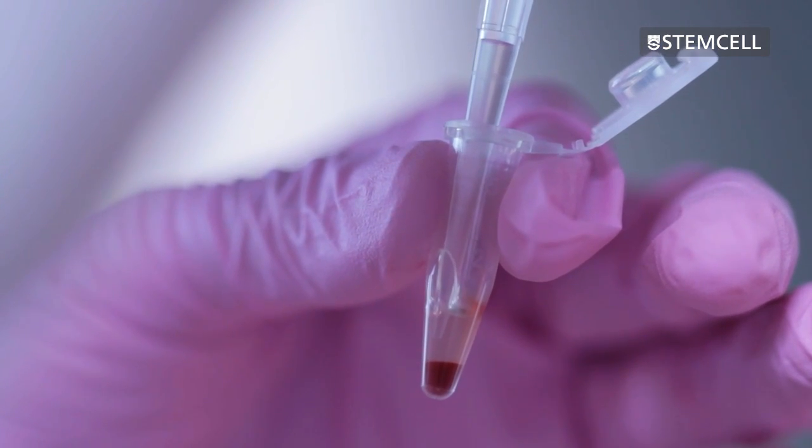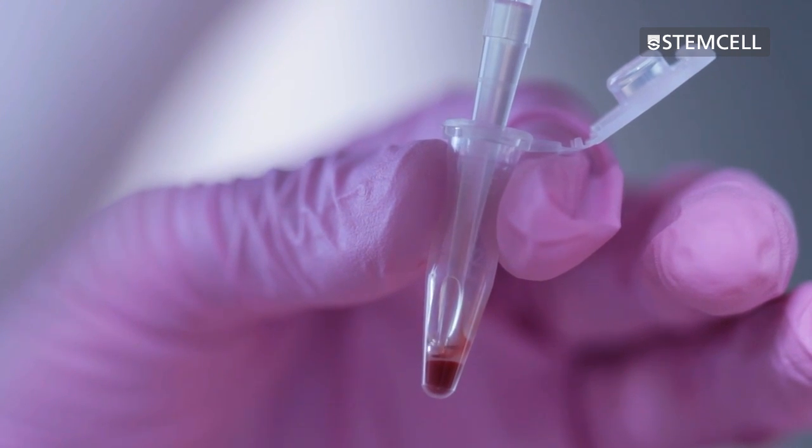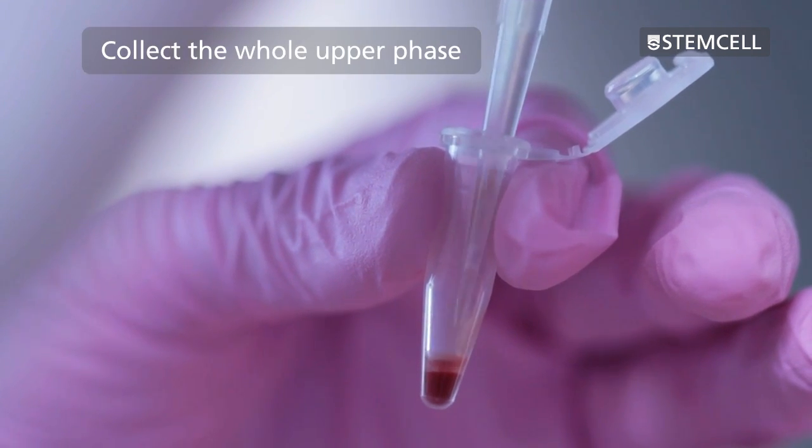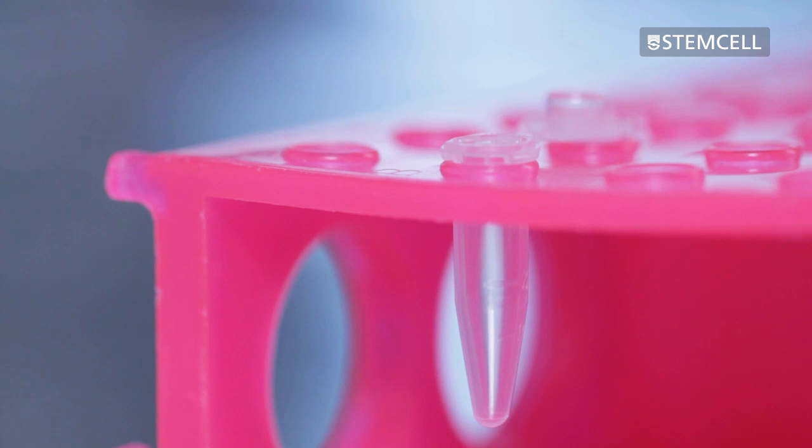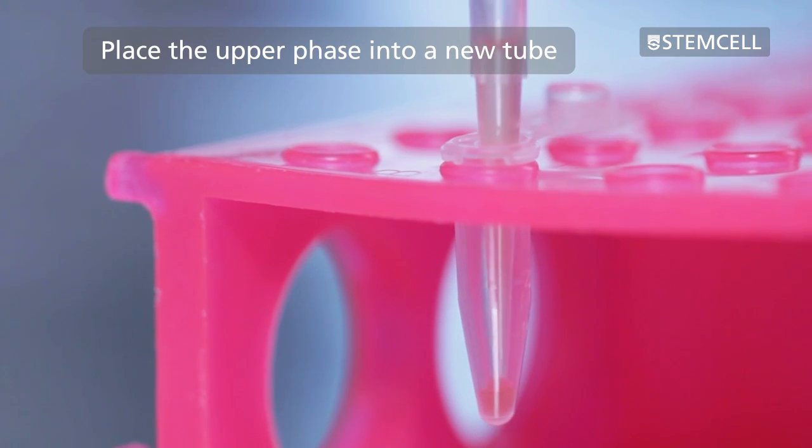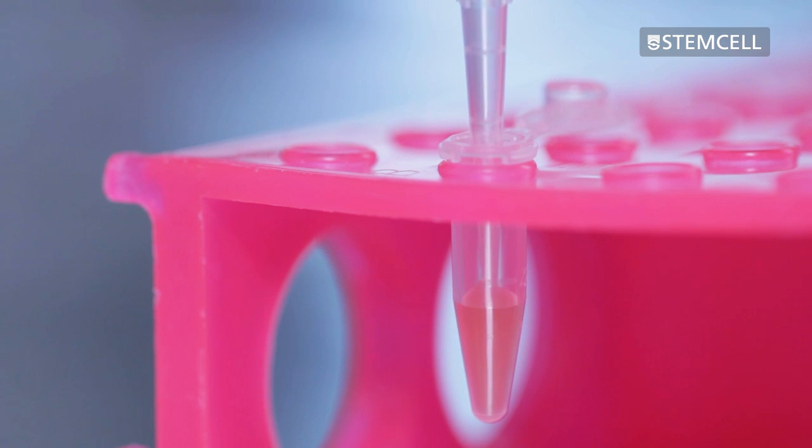To aspirate the upper phase, slowly move the tip downward toward the RBC pellet to collect the whole upper phase. Place the upper phase into a new tube. This is your RBC-depleted sample containing only the nucleated cells.